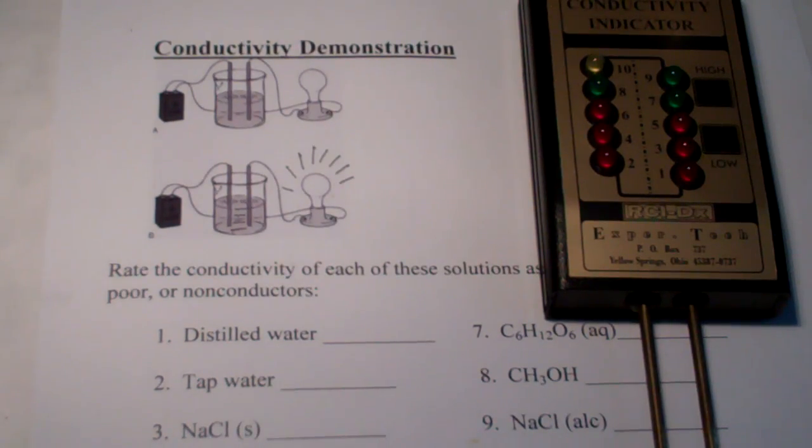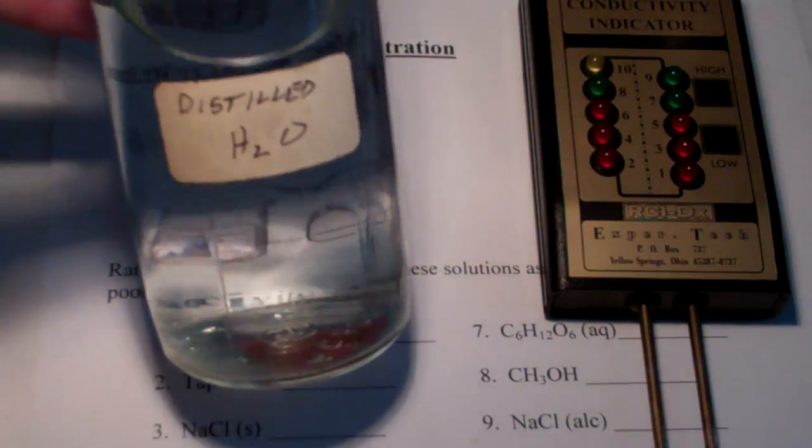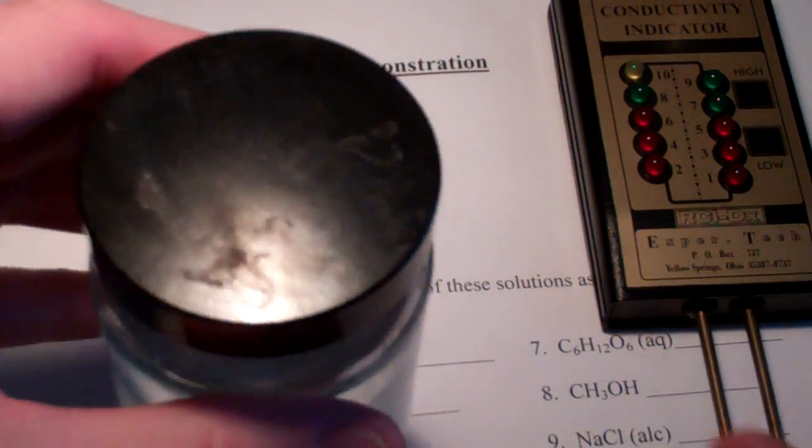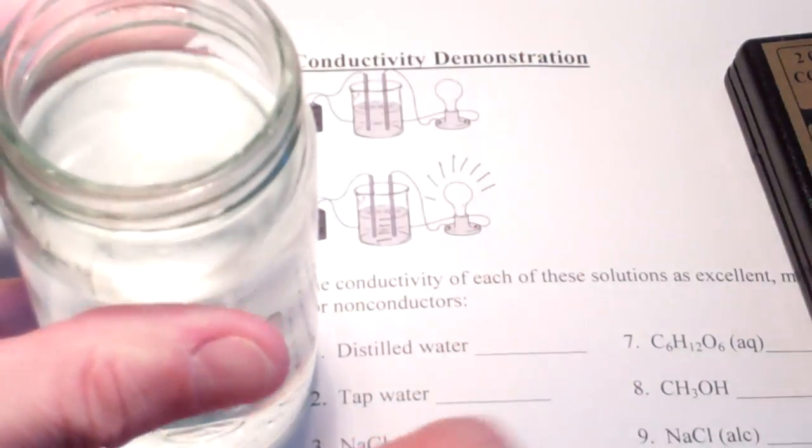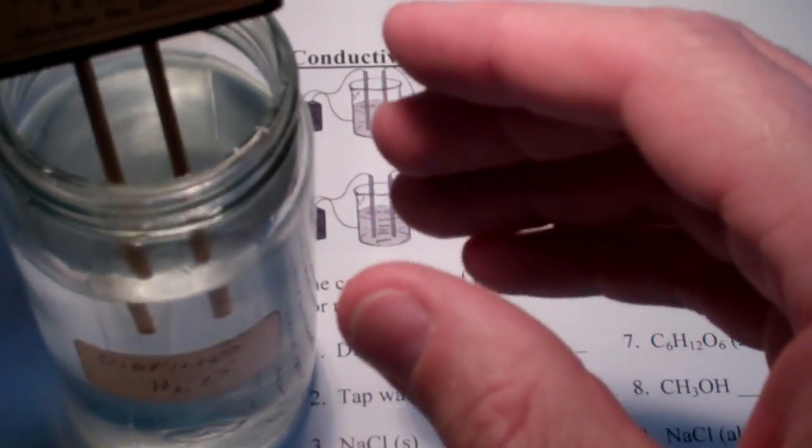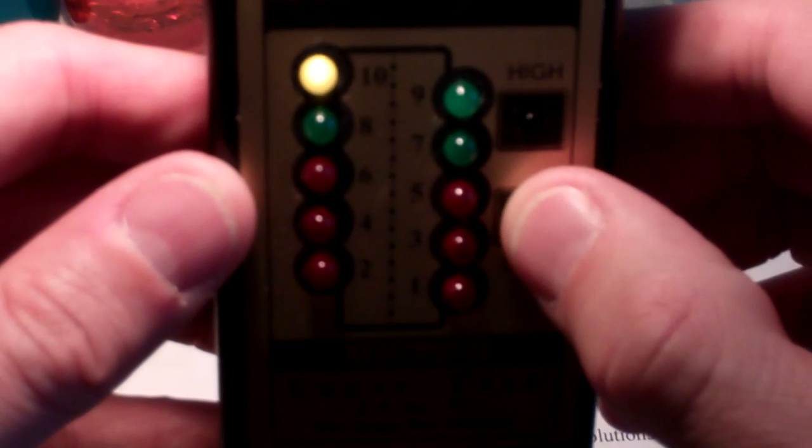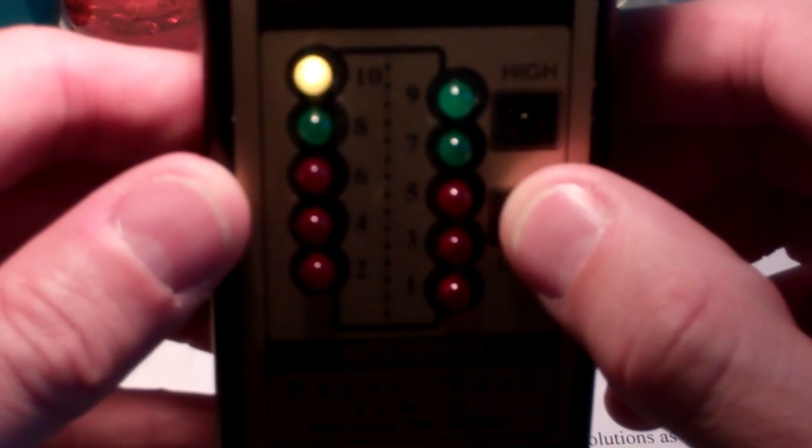So, let's start with distilled water. I have a jar of distilled water here, and we'll crack the lid. Hopefully, we won't make too much of a mess here. And we'll place our conductivity meter in the distilled water, and I will press, to begin with, the low button. And, oh, it says ten plus.